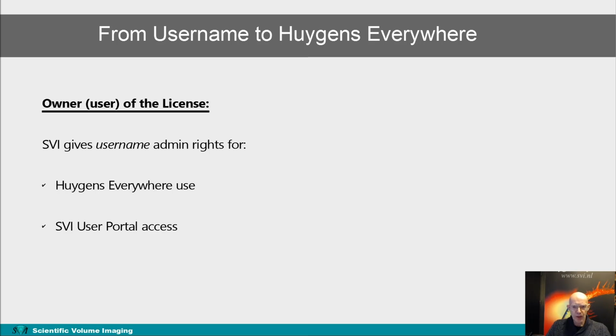If you are the owner and maybe also a user of the license, we will give your username admin rights. This will be for Huygens Everywhere use and also for access to the SVI user portal. I will explain this in a second.